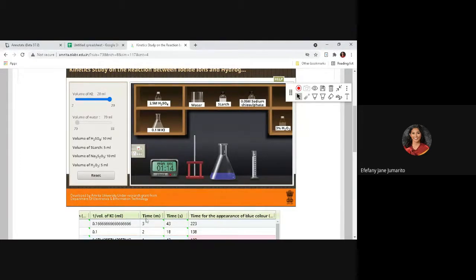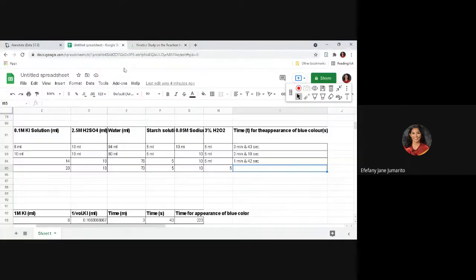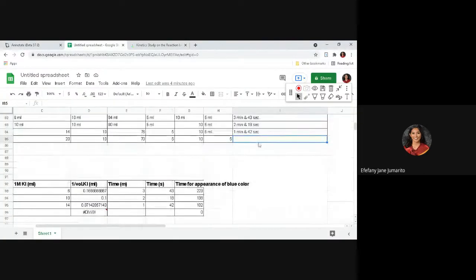Okay, so now, let's take note of the time. We have 1 minute and 14 seconds.